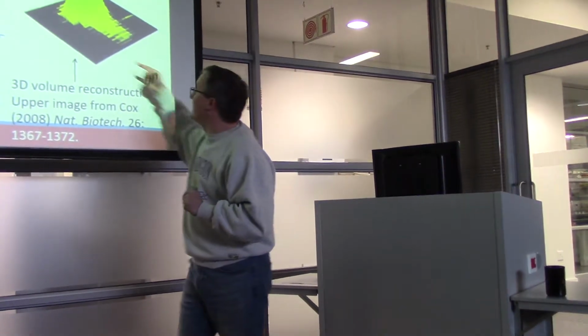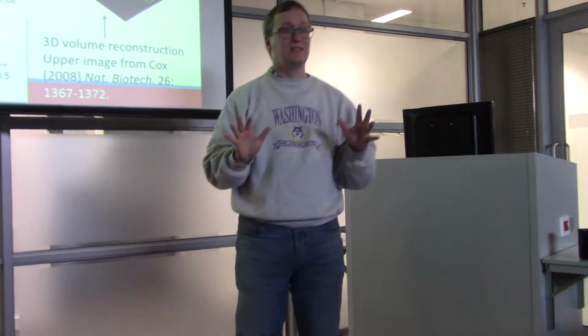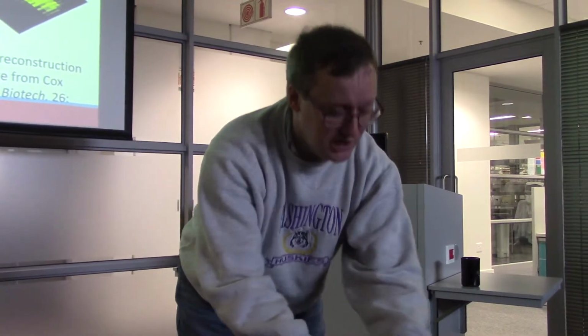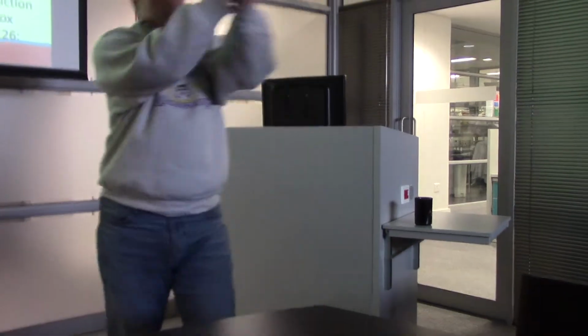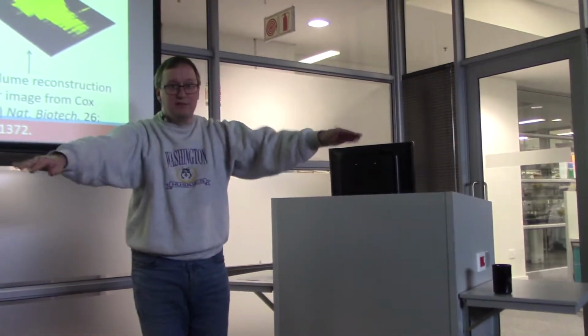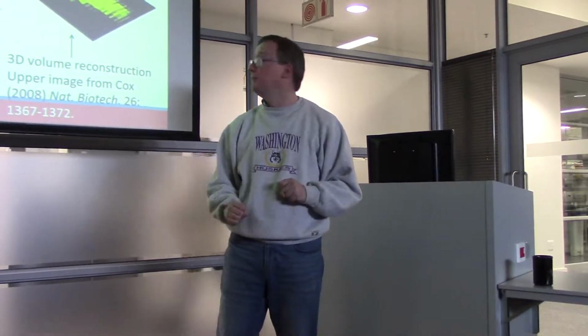And we're looking as a function of time, in this case maybe 30 seconds. So instead of looking at the entire run, we focused on this vanishingly small little area of m over z and of intensity. And we're looking at one peak abstracted away from that big space of all the peaks we saw in the course of an LC-MS/MS experiment.